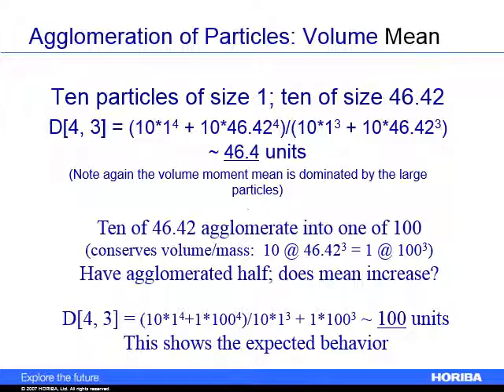Unless you count enough particles, or do it properly, and obviously this is really simplified, but if you expanded this out, your understanding of your particle size behavior and distribution, depending on how you do the statistics and the math, can be very skewed and not really proper for what you're doing. Laser diffraction on a volume basis, because you're measuring more particles, or you're doing it in terms of a volume basis, you can actually keep your math much more in tune with what you'd expect.